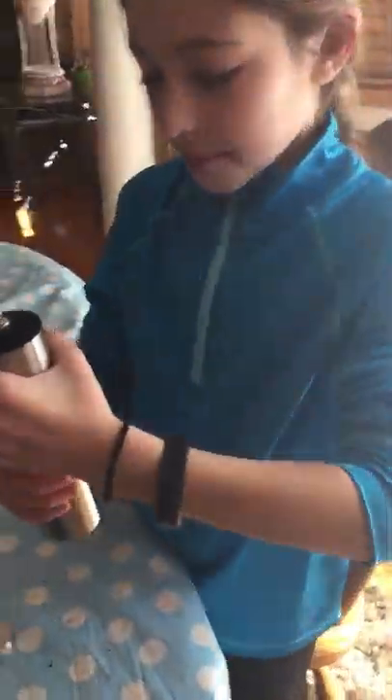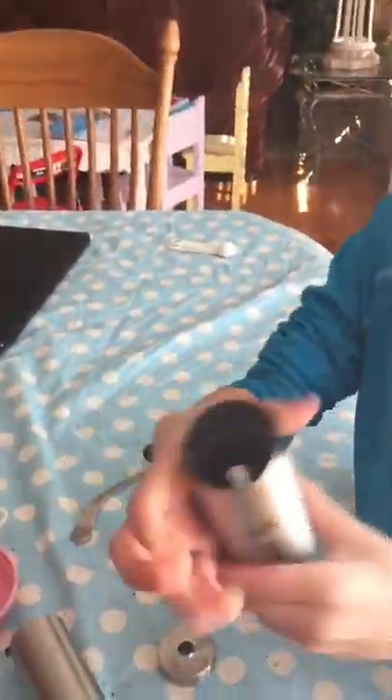So you disassemble — you take it apart and you have the grounds. You can see it now. And then you're going to get a piece of paper that your teacher's going to give you, and you're going to dump it out on that piece of paper.